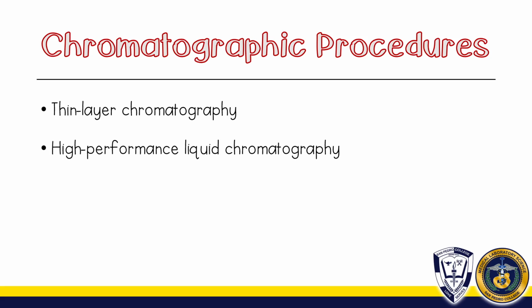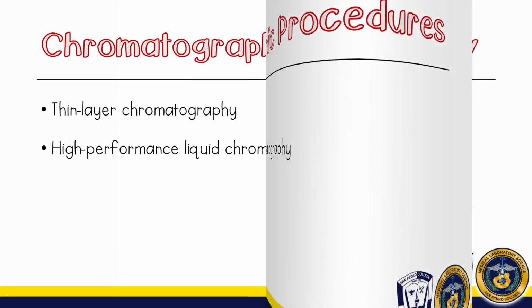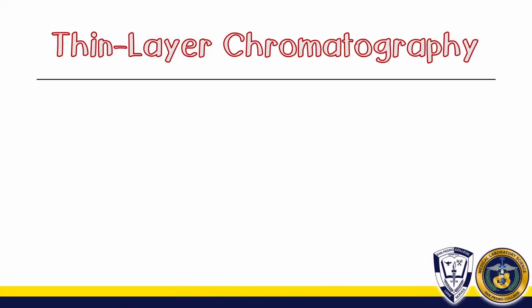The first thing I want to point out is that it has the highest sensitivity compared to the other procedures that are currently present. Because you have research, you can consider it. But another factor you can consider is cost, because HPLC is actually expensive. Anyway, going back, first is your thin layer chromatography.